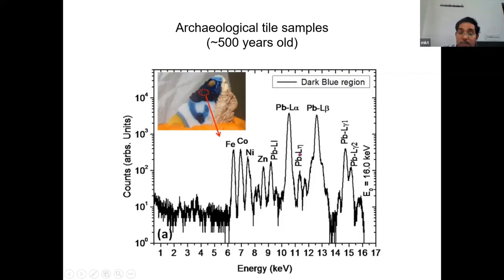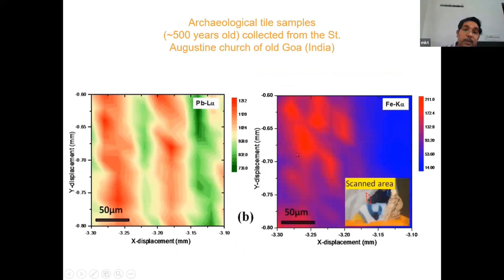And for the polished surface, they allow the lead basically to generate the very polished surface. So we were not knowing that the lead is also very toxic. And then we did some cross-section analysis. So the cross-section analysis shows these different layers. There are several layers of lead they have applied before generating the polished surface.